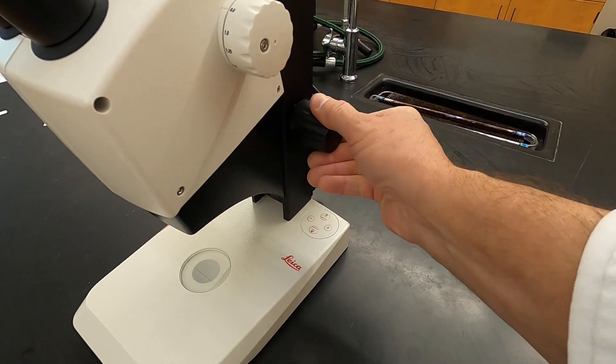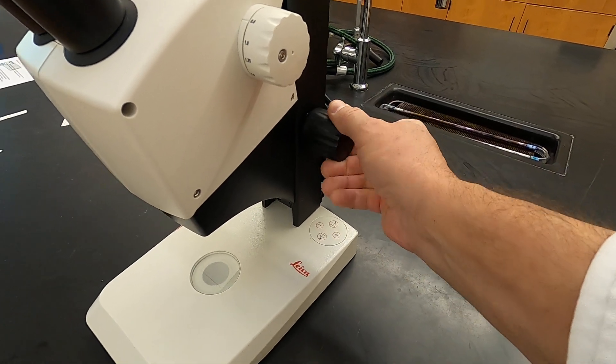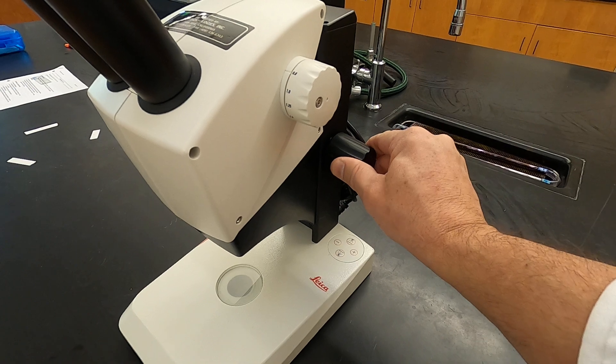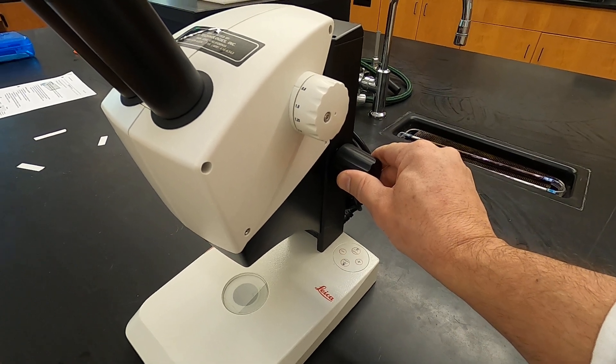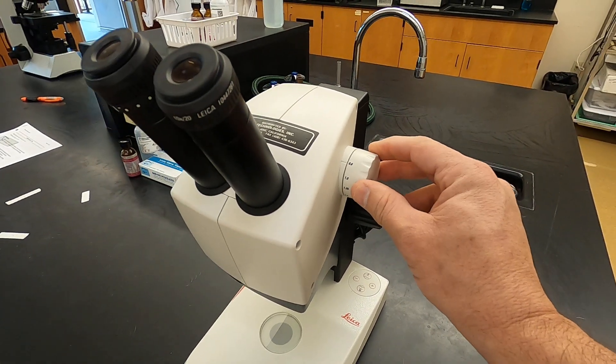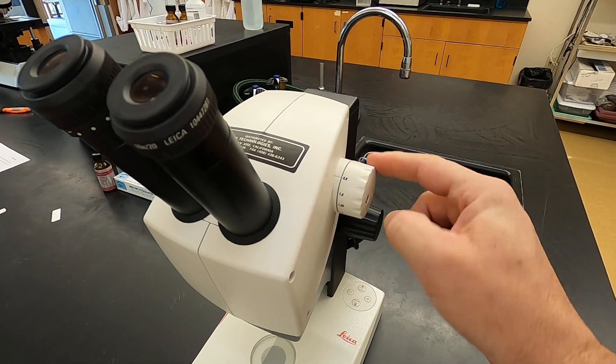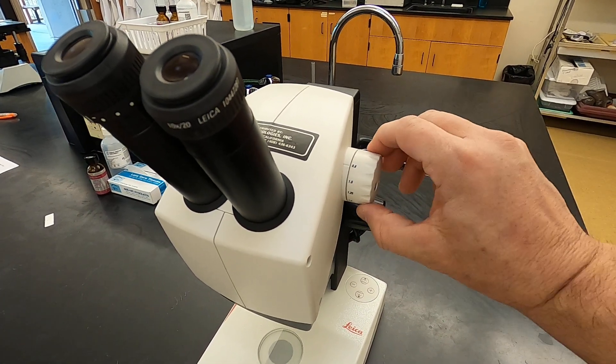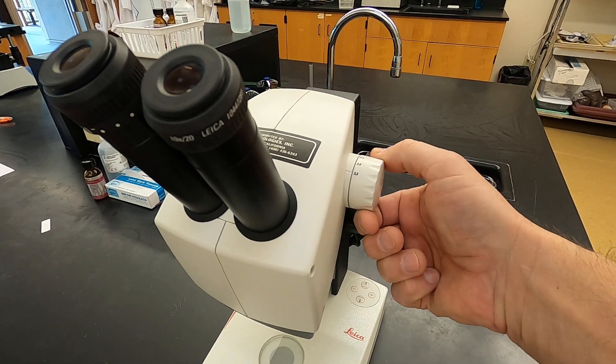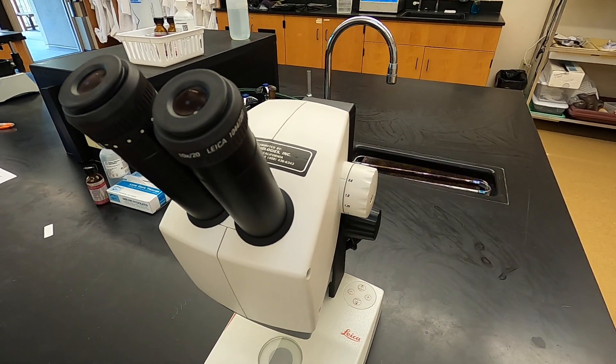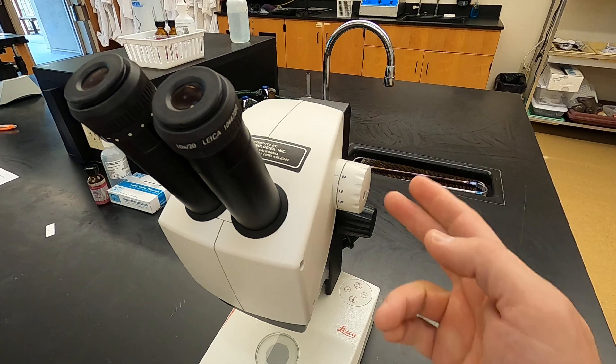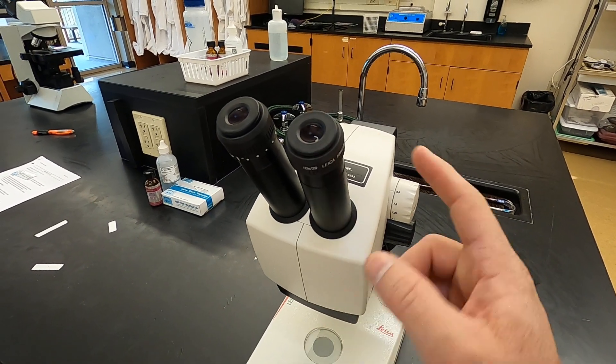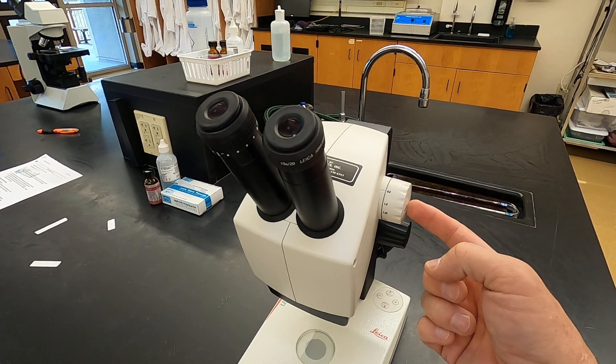These on the side of the arm here, this is your focus knob, and there's one on either side of the arm for you to use. And this right here is your magnification. The magnification here goes from 0.8 all the way up to 3.5. I'll explain in another video how we can calculate the total magnification given the power of your oculars and the power that this knob is set to.